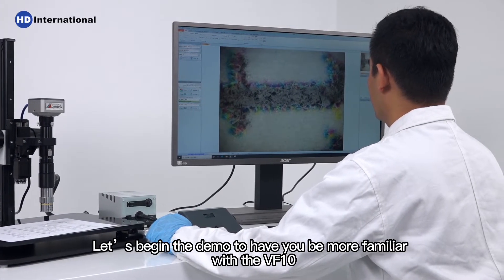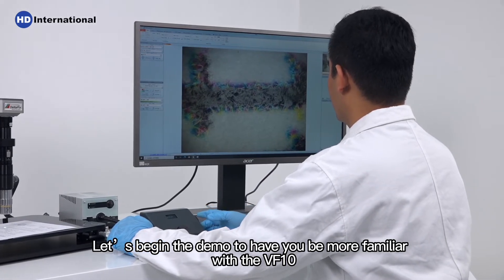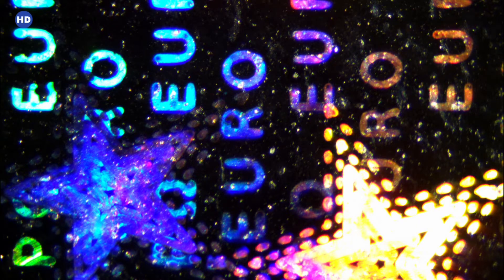Let's begin the demo to have you become more familiar with the VF-10.